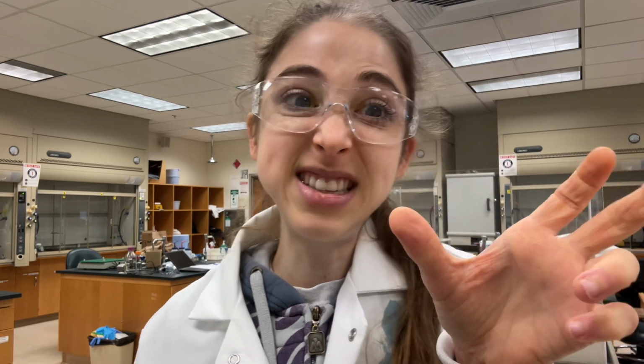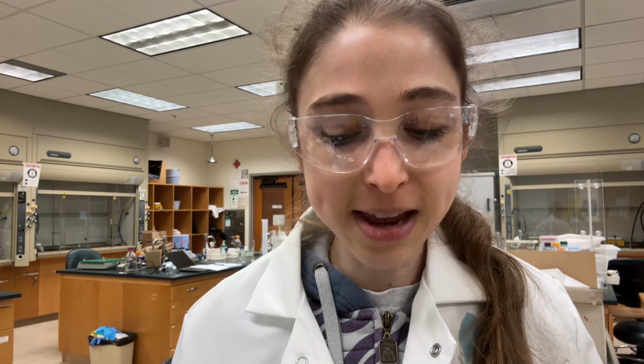So basically what can happen is that there can be some sort of boo-boo where they get the kanamycin resistance, but they don't actually do the swappage. I don't know, biology does weird things sometimes. And so we're going to want to double check. We're going to do colony PCR, take these primers, which will amplify a region that contains part of the kanamycin gene and part of the thing next to it, and then see whether the bacteria actually contain the region that we wanted them to. And then we can go and sequence it, make sure it's all okay. But the first step is just being able to do that selection.